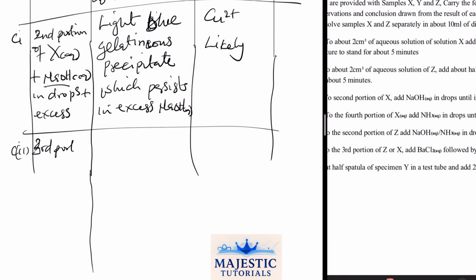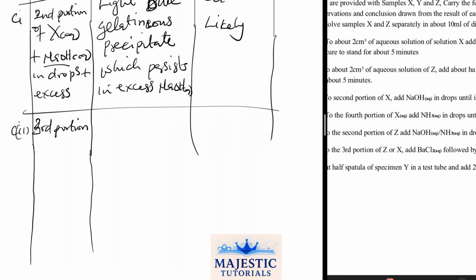The third portion, what I'm using as the third portion might be your first portion in the exam. Third portion of X aqueous, because you have been told to dissolve it in water, plus aqueous ammonia in drops plus excess.